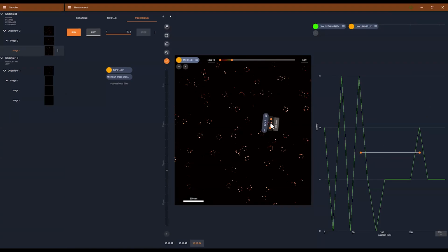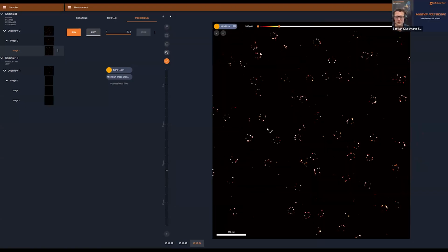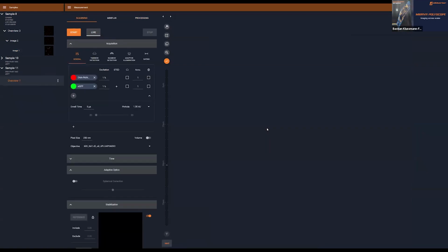Okay? Yeah, thank you. Also, one comment here. If you have questions, please interrupt me. I'm happy to answer all your possible questions. Now I would just change the sample to a different sample. And there I will explain in a little bit more detail how the Lightbox software works and the imaging at the MIRAVA. Please give me a second. And as I said, if you have a question, please ask right away.